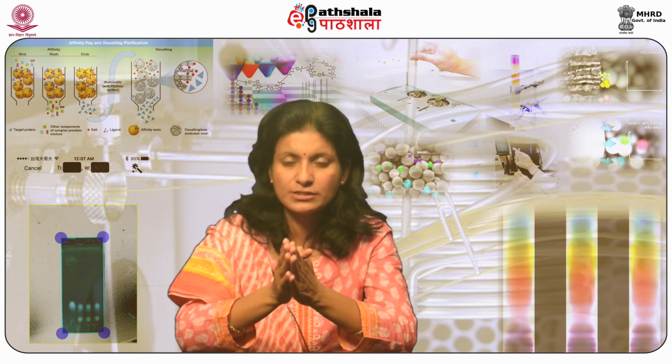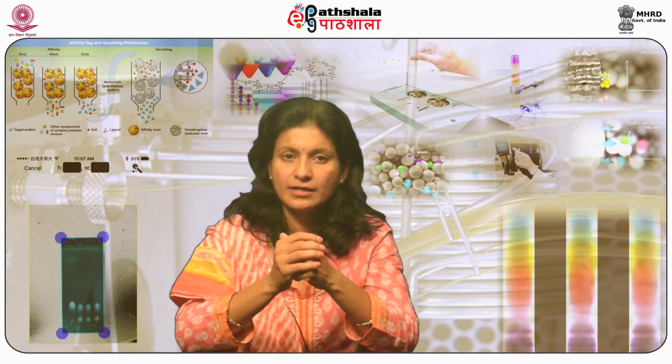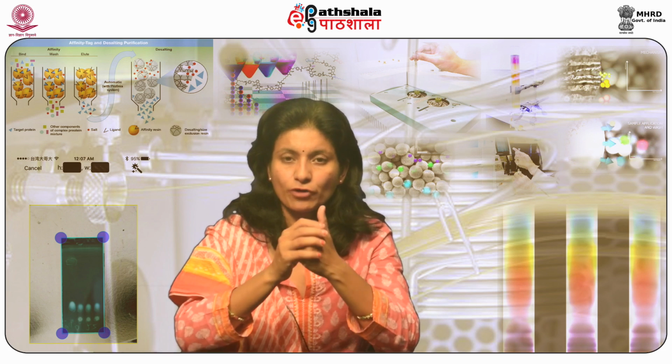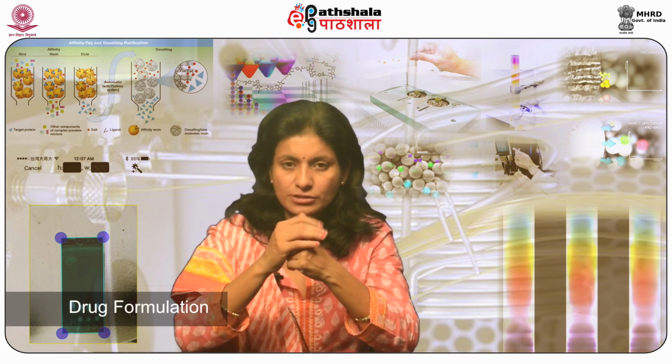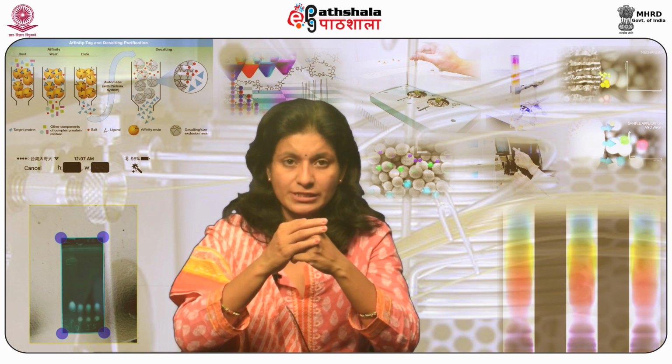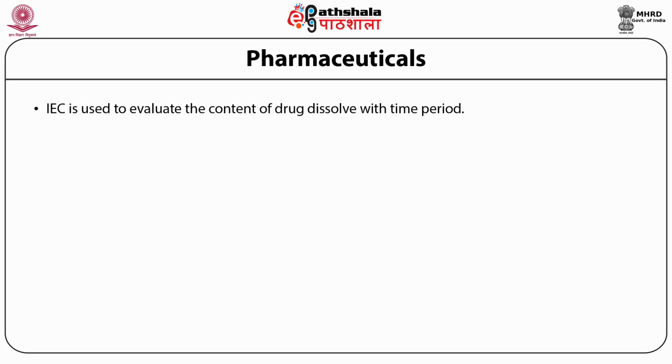Some of the examples of the use of ion exchange chromatography in pharmaceuticals are: it separates the cations in water solution for injectables. It analyzes the final drug formulation and helps in the pharmaceutical industry. IEC has occupied its place in drugs in the form of capsules and tablets in order to evaluate the content of drug dissolved with time period.